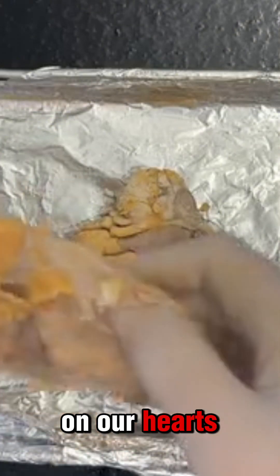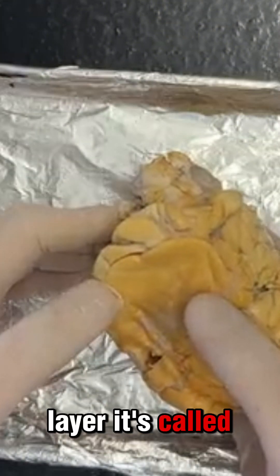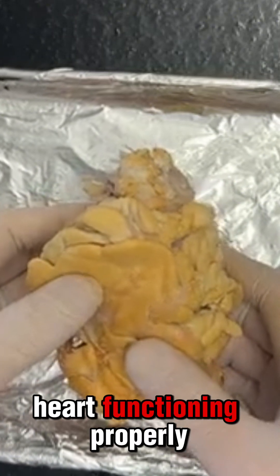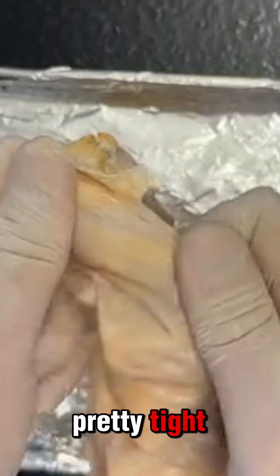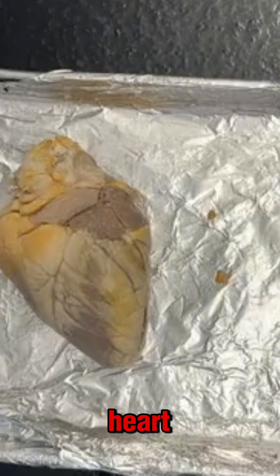On our hearts you have this layer of fat. Here it's a protective layer called the pericardium. It's a fluid-filled sac that surrounds the heart and keeps the heart functioning properly. When you take off this fat membrane, you can see I could stretch it — it's pretty tight. I could poke through it, but my finger is not going to go through it. So this is a pretty important layer of our heart.